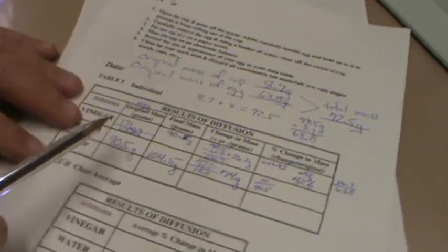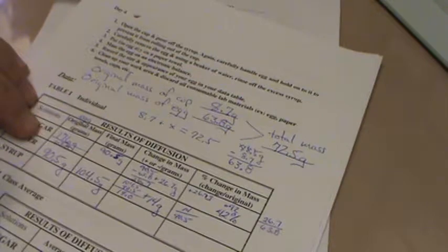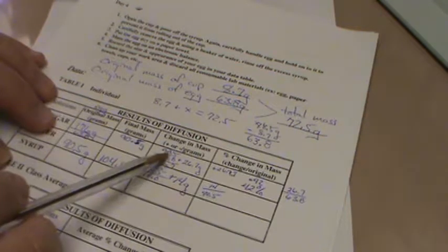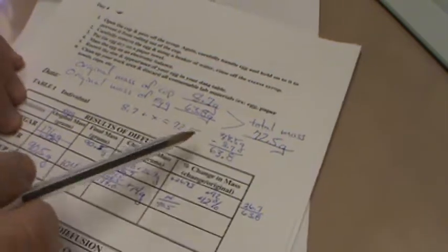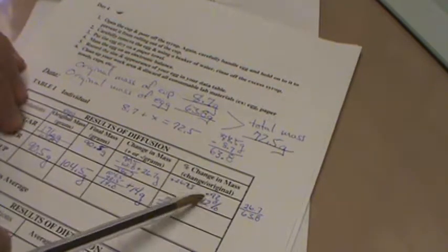We can always go back and find our original mass. And we're even off on this one because we should have subtracted the weight of the cup, which is 8.7 grams. So that's thrown this one off. That's my mistake there.